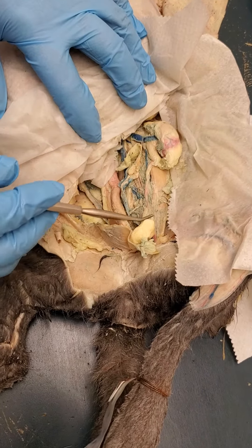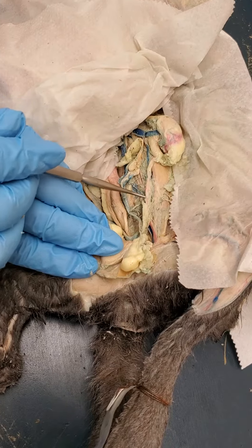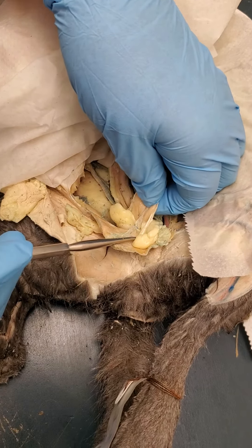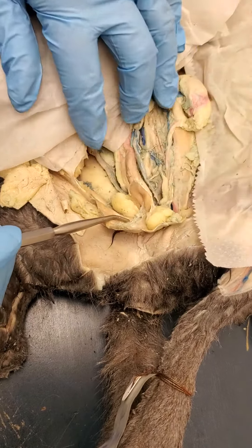Here's the kidney, and here's a ureter right here. Here is her bladder, which as you can see seems to be a lot smaller. I did not dissect out her urethra and all of that.